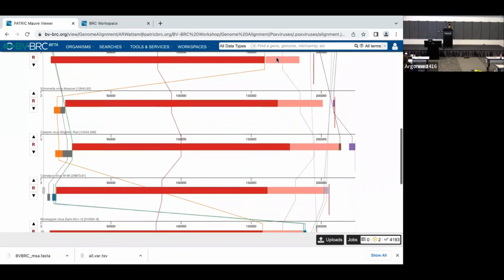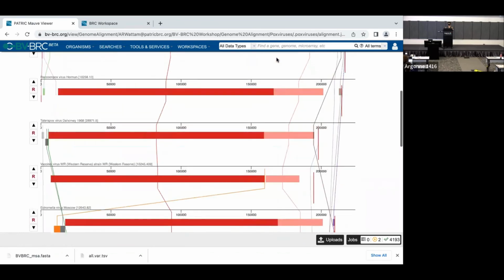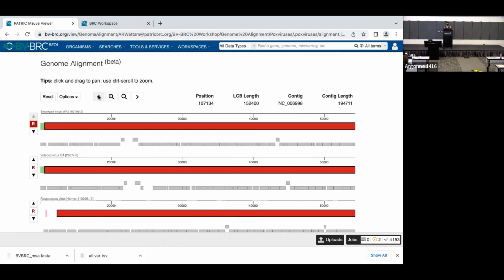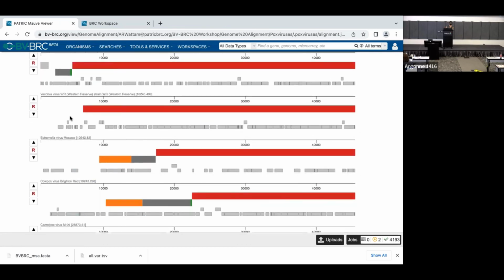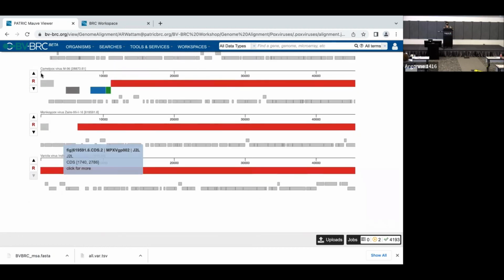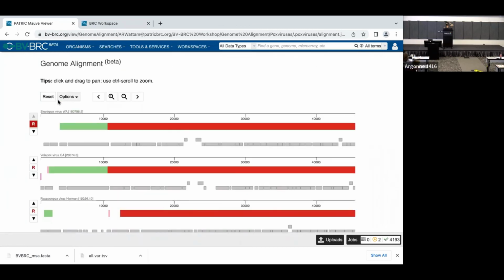Cow pox, camel pox. Oh, Malik, you have succeeded beyond my wildest dreams. That is fascinating. Look at that. Isn't that cool? I want to go in and see what these, well, looks like there's a, oh, look at that. Oh, that's just fabulous. How much fun. I'm a little worried about these genes that are floating off in space. Oh, I can see that there's something here that in the visualization is a bit wonky when I dig into it, but still, it does work.